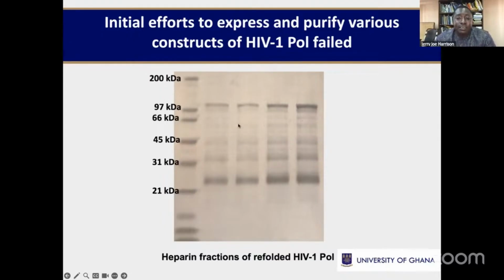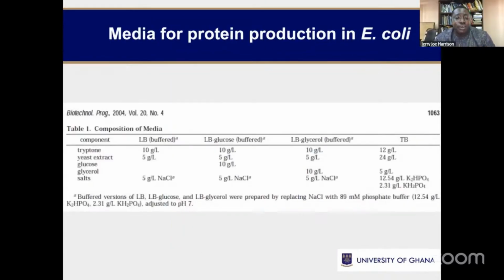Basically, as you can see, there's a lot of proteolysis going on, and many of the proteolytic products could not be purified away from the full-length protein for any meaningful study. And so again, when your strategy doesn't work, you go back to the drawing board. Most of the time, you go back to the media to see what we can do.